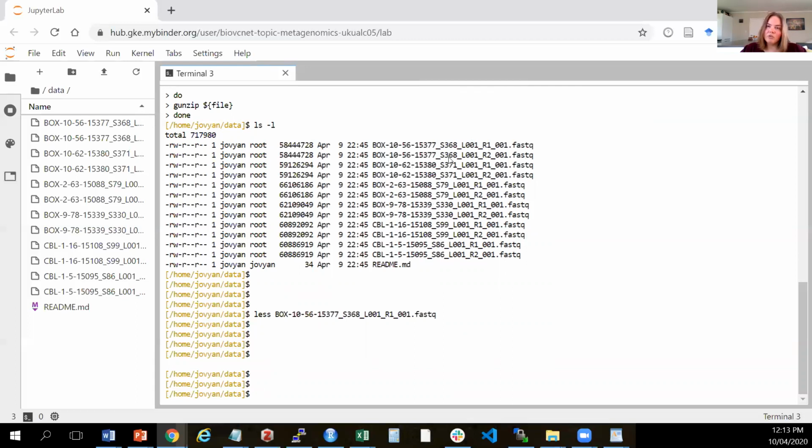There are a lot of great tutorials on FastQC already available, so I'm going to give you some links to those as well. But I'm just going to show you how to run through each of these files. So the first thing we're going to do is make a directory for all of our output to go to. The way you do that is with mkdir, space, and then we're going to call it 00 FastQC.